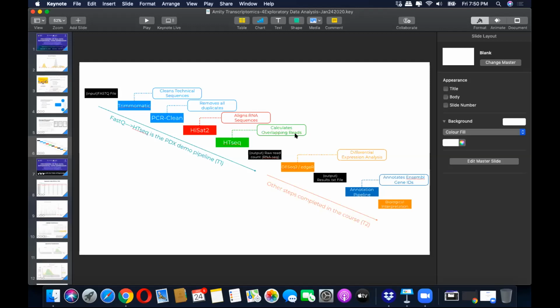It is important because out of 100,000 genes, or 7,000 genes, we need to extract some genes that are informative for our comparison between samples. In our case, we are comparing triple negative versus ER positive, like we showed you in the data set, and we will be going through it again, so nothing to worry about.